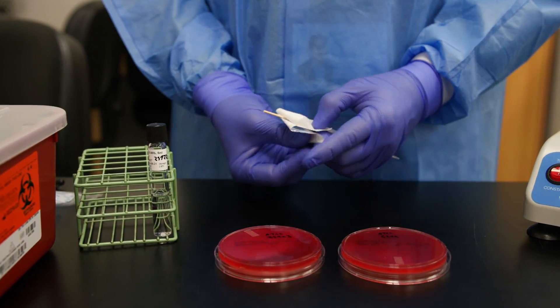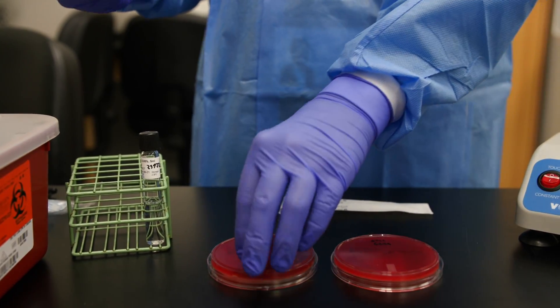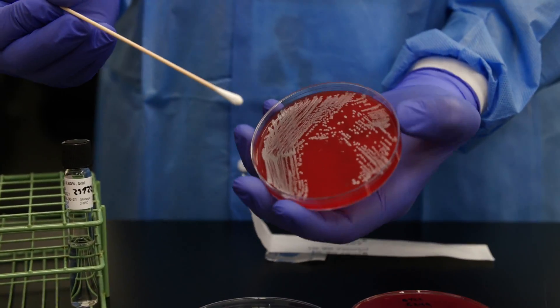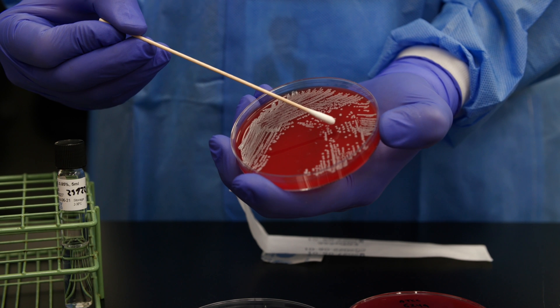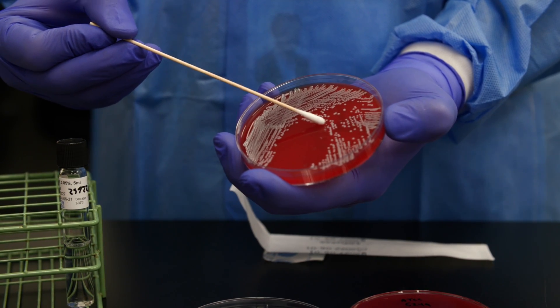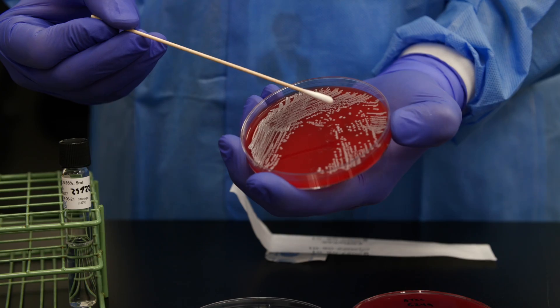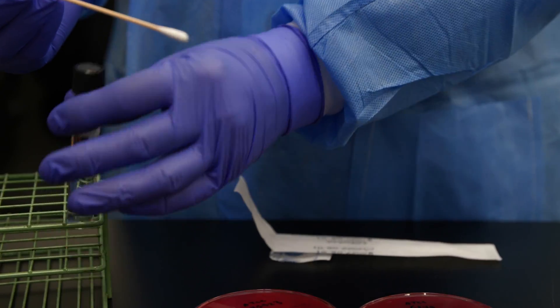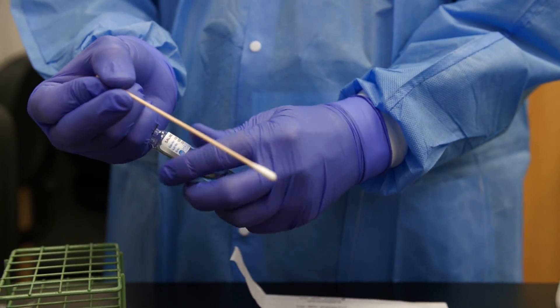To begin, using aseptic technique, use a sterile cotton swab and touch 3 to 5 well-isolated colonies. The number of colonies will vary depending on the particular organism you are working with. In other words, if the colonies are small, then you will need to pick up more of them.